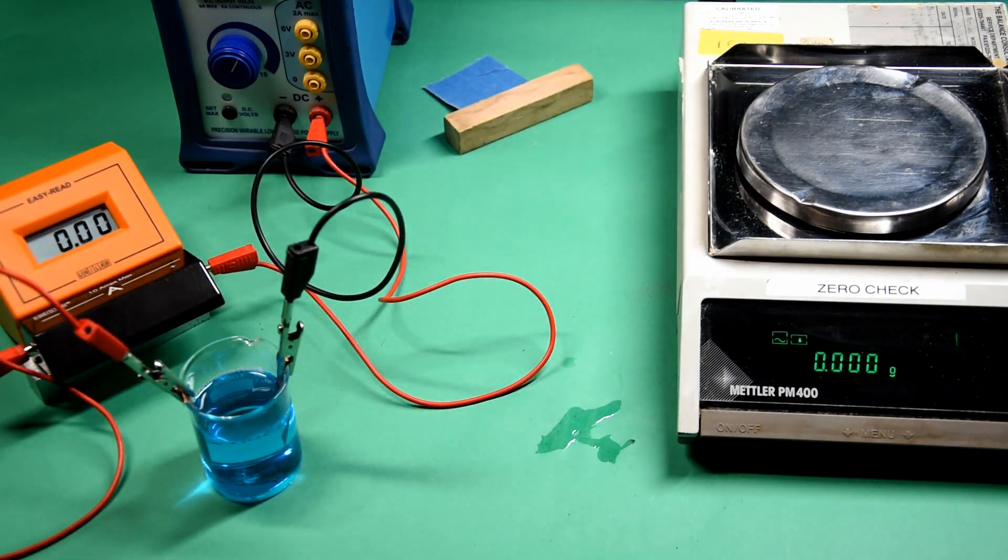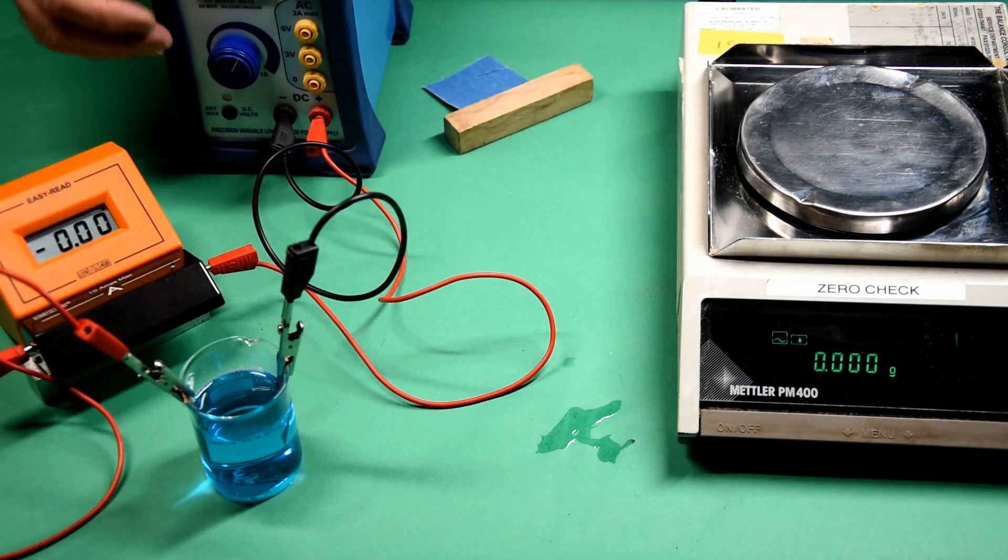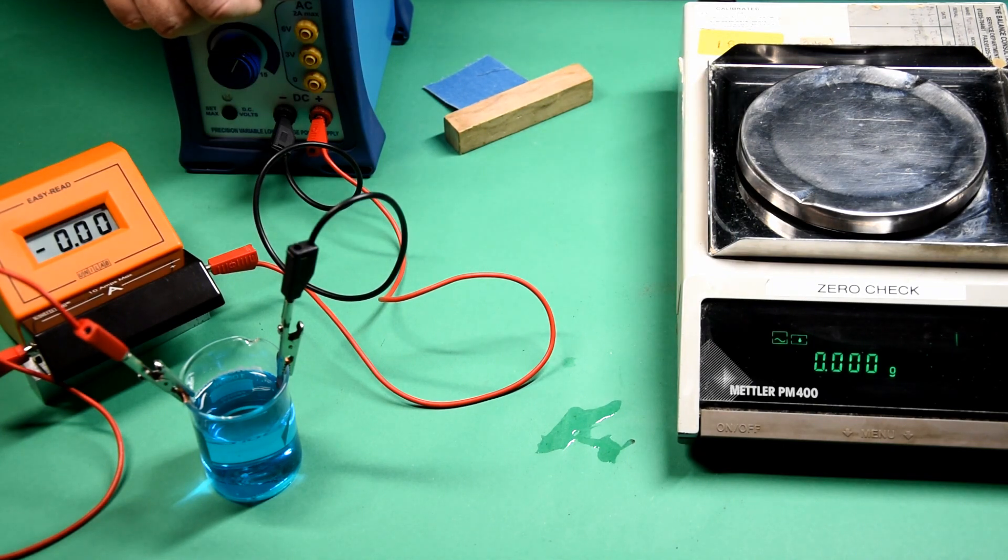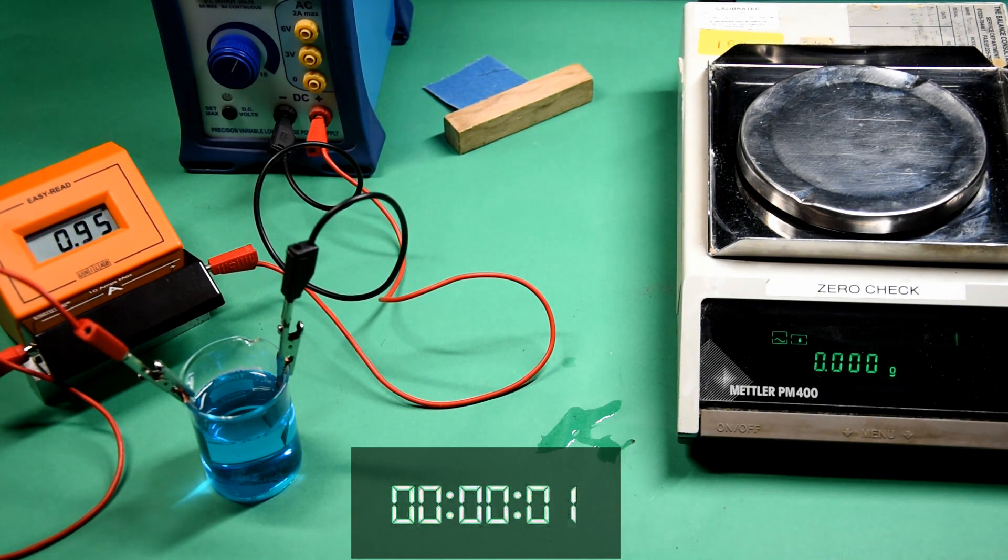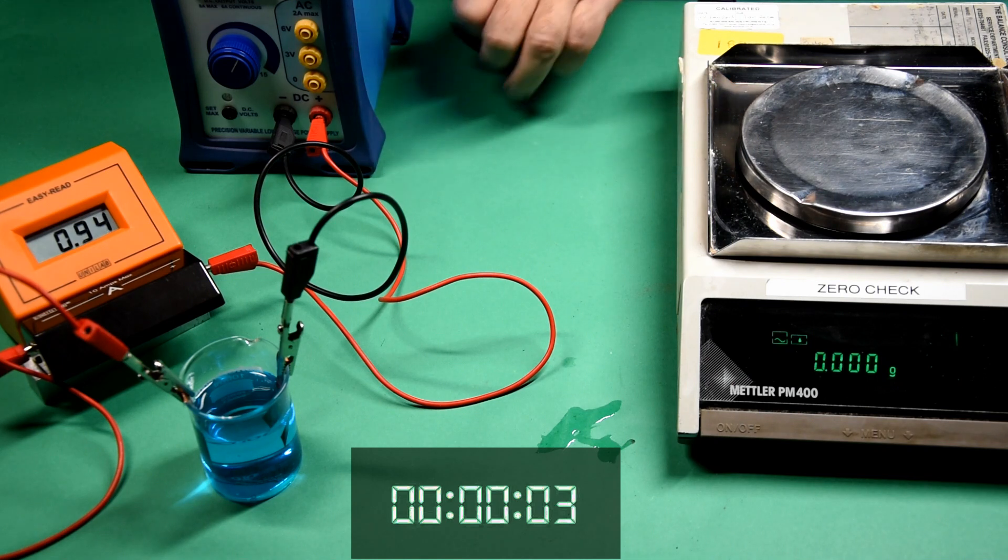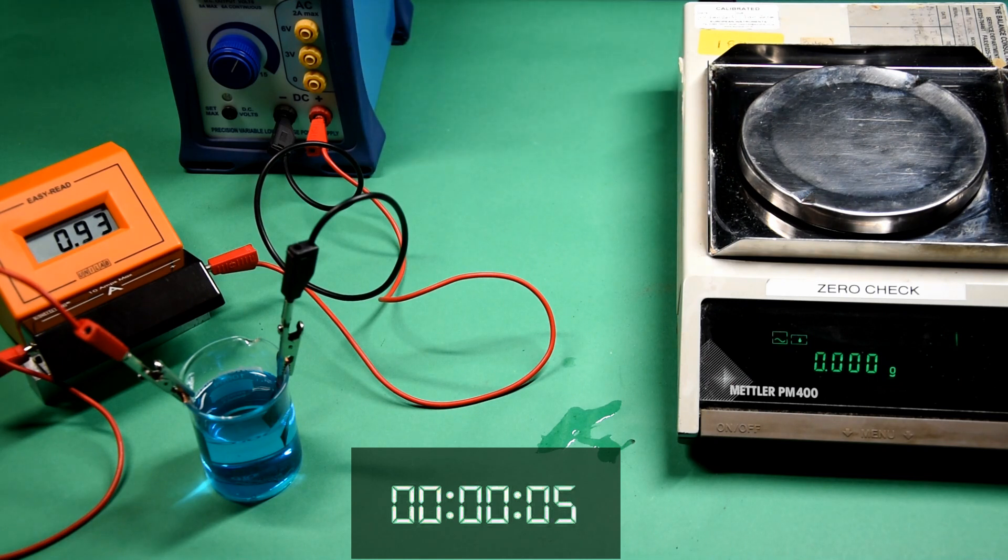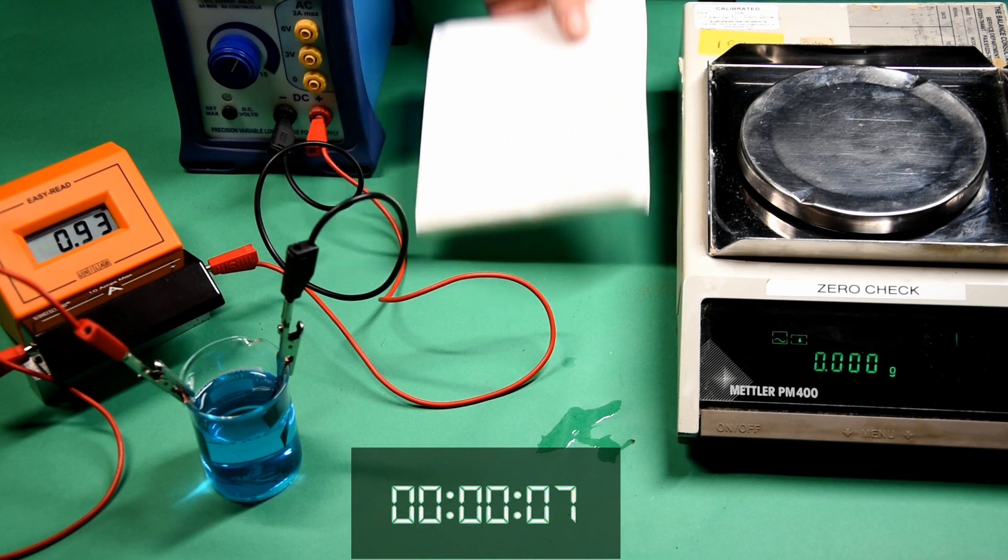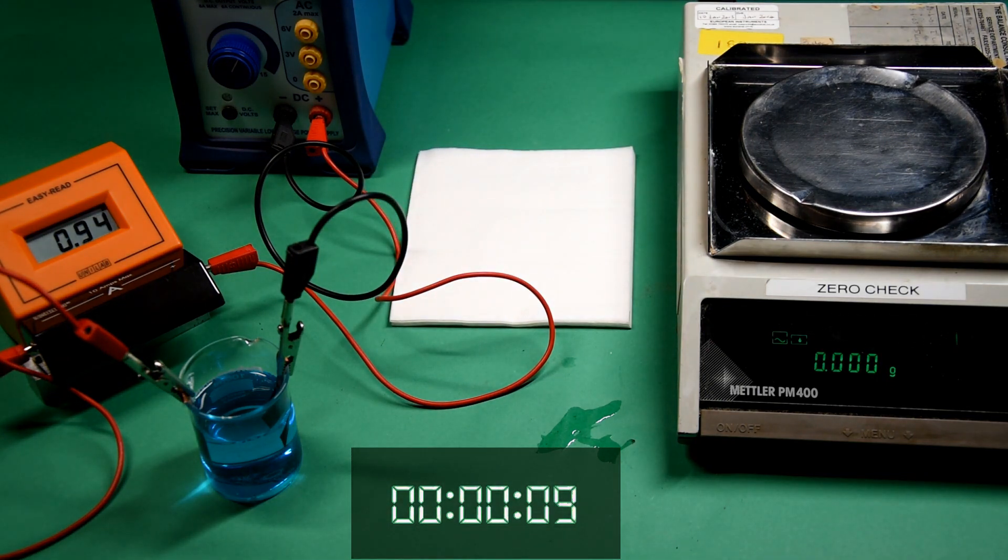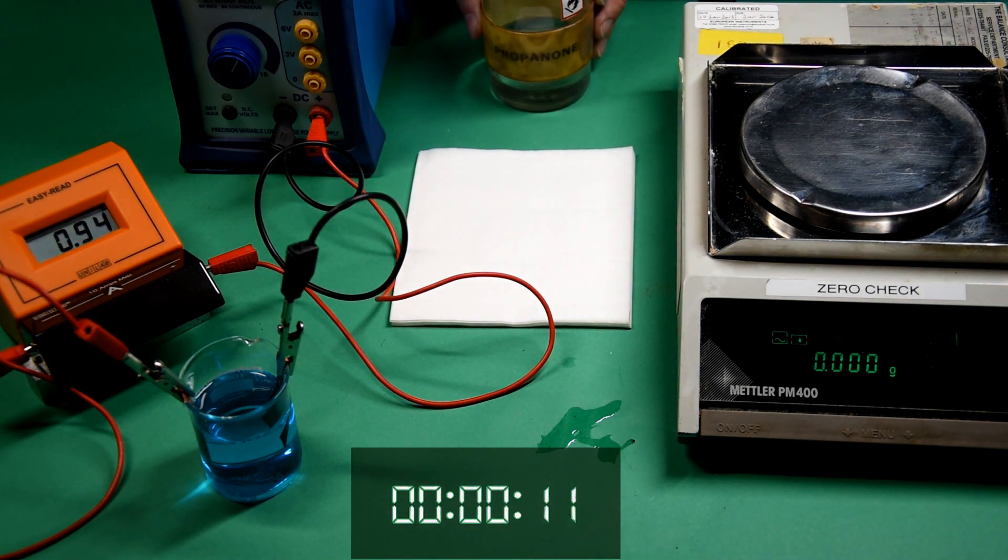The circuit is complete and the power can be turned on. We're making a note of the time and the current because we could use this to calculate the number of electrons flowing and the theoretical mass of copper deposited.